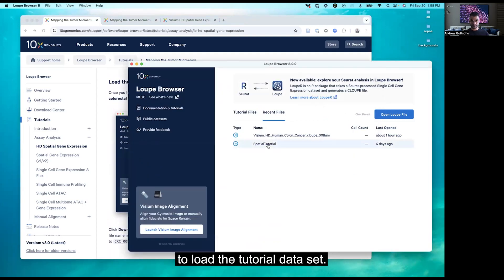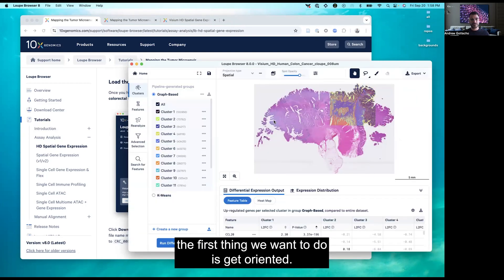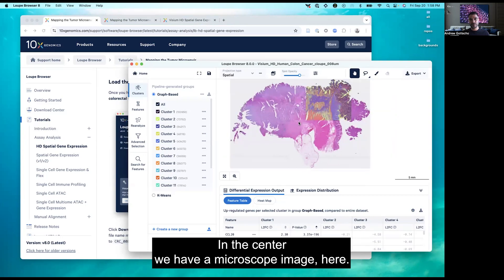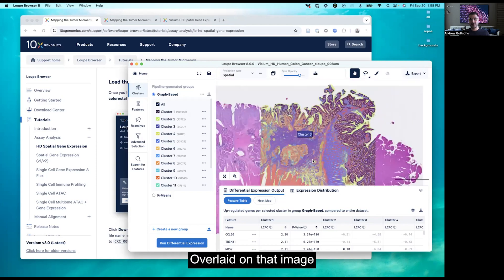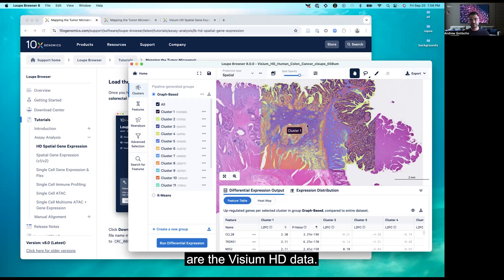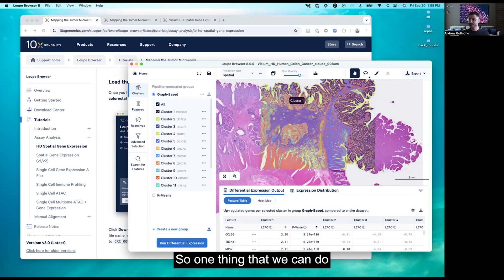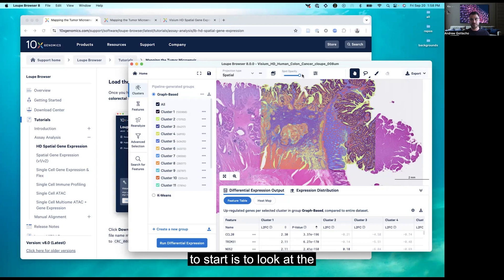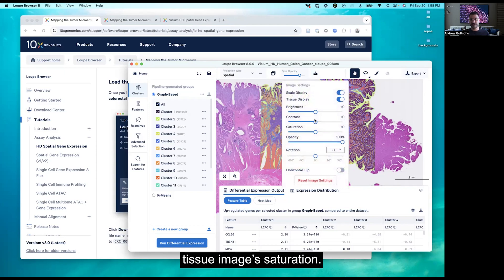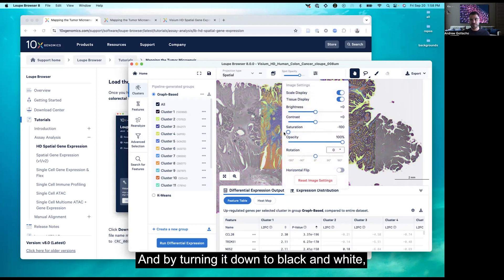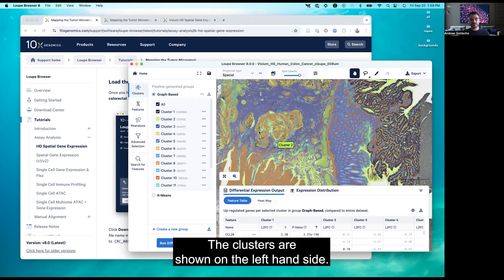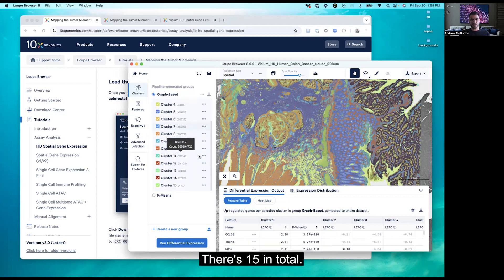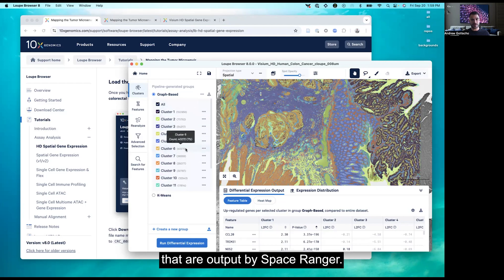To load the tutorial dataset, I've already loaded it, but you can follow the instructions in the tutorial. The first thing we want to do is get oriented. In the center we have a microscope image — this is an H&E image. Overlaid on that image are the Visium HD data. To help with the many colors, we can look at the tissue image saturation and turn it down to black and white so you can more readily see the colors corresponding to clusters. The clusters are shown on the left-hand side — 15 in total, and these are graph-based clusters output by Space Ranger.